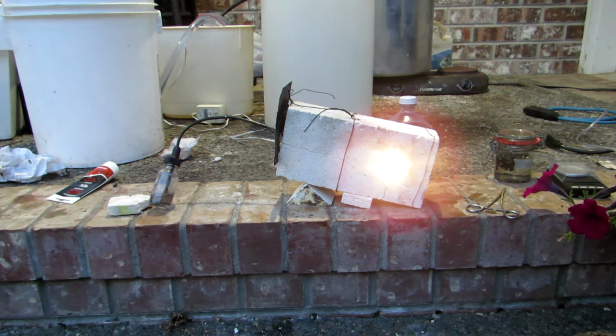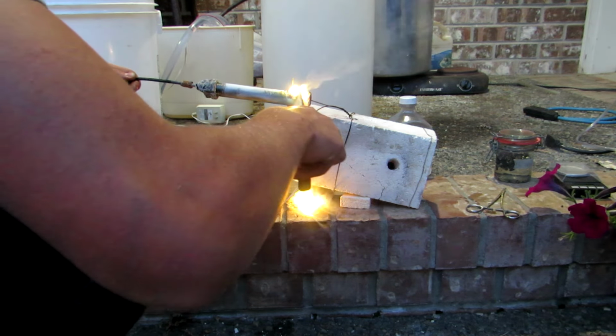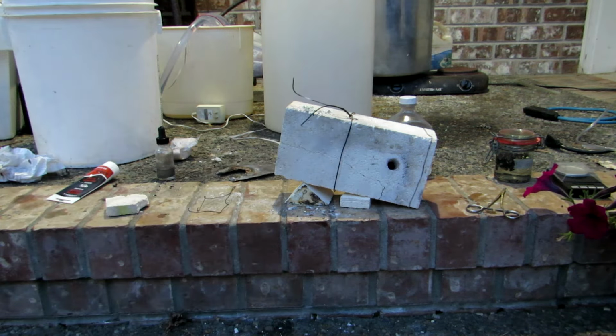Unfortunately, partway through the distillation, a small leak occurred in the steel tubing and a potassium-lithium fire was observed. Clearly my welding job was not sufficient. Thus the reaction was stopped early.